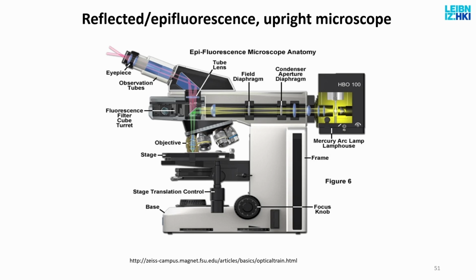As you see, this has the advantage that down here nothing happens. So you can build the microscope in such a way that you only use one lens for both excitation and emission. And now you will remember the formula, lambda divided by 2 times NA for the resolution. That's why 2 times NA and not NA1 plus NA2, because I'm using the same lens twice. The big advantage is that if I use the other way, the second lens would have to have an equally high NA as the first lens.